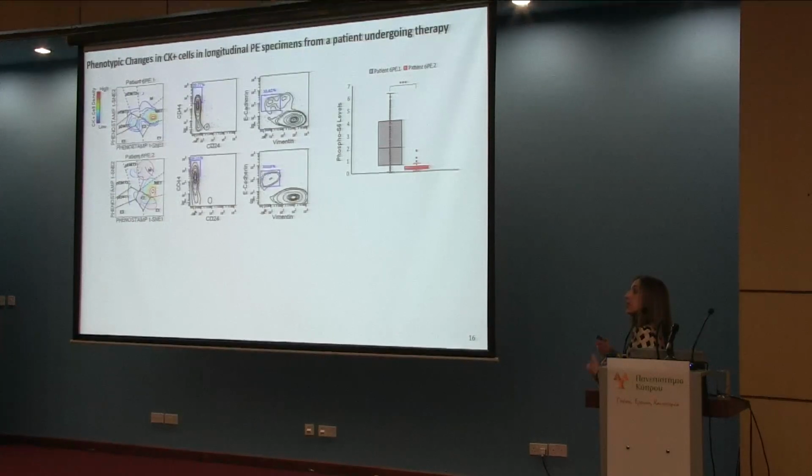And then another clinical aspect of using such a map, right? Here I'm showing you 2 specimens from the same patient taken 2 months apart. So the patient is undergoing combination therapy of EGFR inhibitor and chemotherapy. And then you can see that most of that patient's cells were in this state. And then after 2 months, you see the cells occupying different areas of the map. Some of them became mesenchymal, which is something that you would expect because that's what happens with drug resistance. Some of them became different epithelial, right? And you can see that in the plots, the flow cytometry plots, CyTOF.